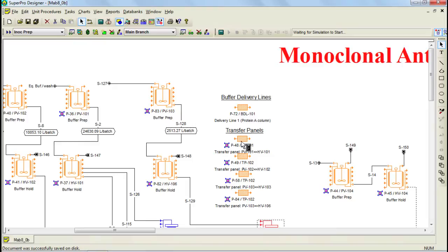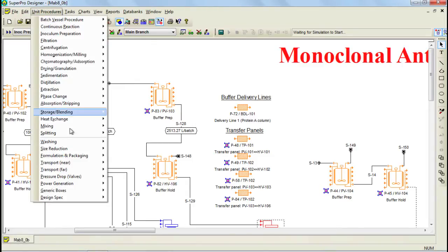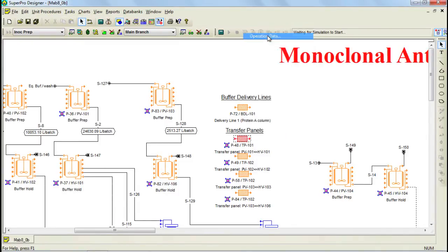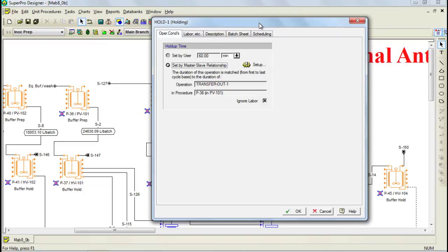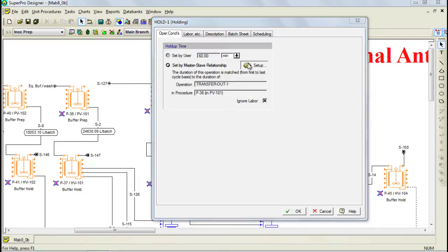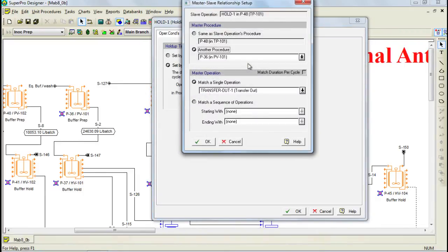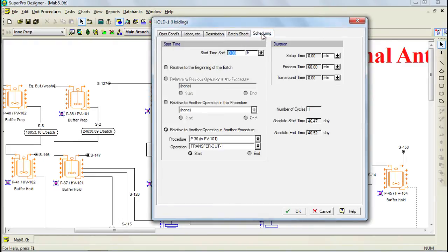Generic boxes can be found through the Unit Procedures menu under Generic Boxes. The operation that has been added to the transfer panel is a hold operation. The hold-up time is made equivalent to the transfer time from any given preparation vessel to a holding vessel. This can be done by selecting the set by master-slave relationship and then setting it up to be equivalent to the transfer out time of the unit procedure of interest. You also need to ensure that the scheduling has been specified to start at the same time as the transfer out operation. In this way, the transfer panel occupancy is captured and can impose constraints on the schedule.